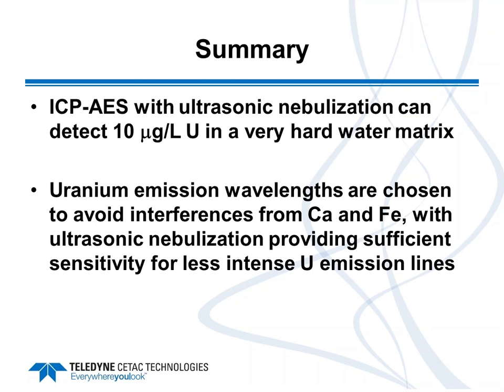If coupled with an ICPMS, what sort of oxide ratio could you expect with an ultrasonic nebulizer? Cerium oxide to cerium? Yep. You will see similar ratios versus the standard pneumatic nebulizer. That can typically be, depending upon the spray chamber system you have, 0.5 to 1% cerium oxide, because even with the condenser in line, you will have water vapor that still goes out and gets into the ICP.